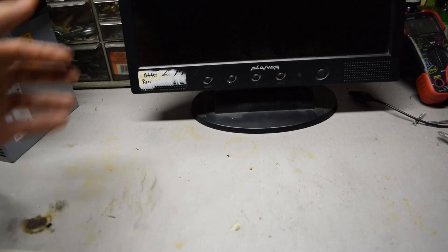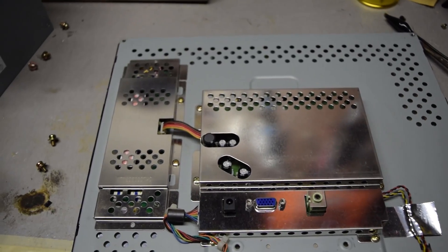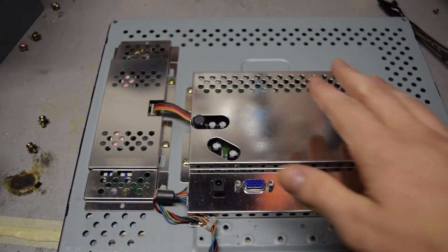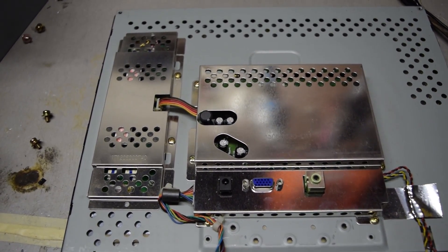Inside the monitor the component that's going to be required is the diffuser. This is basically a sheet of plexiglass and in order to get it the monitor has to be completely deconstructed. I'll show a few steps along the way. I've removed the back cover from the monitor and both of these boxes contain no useful parts so they can be removed.